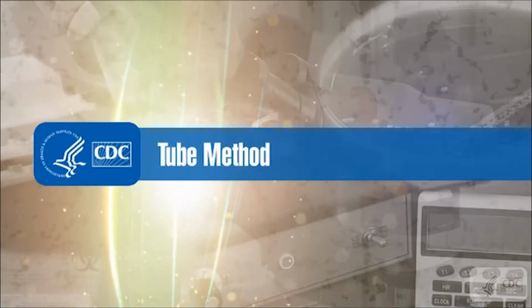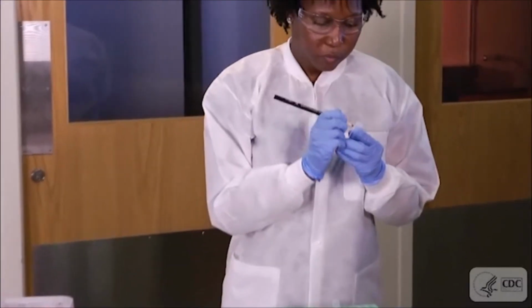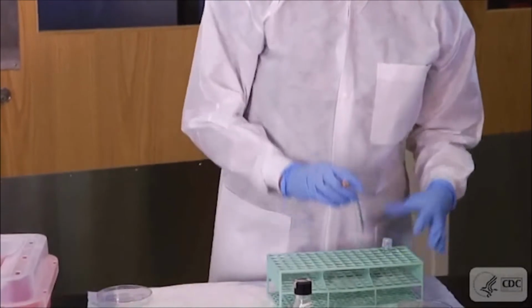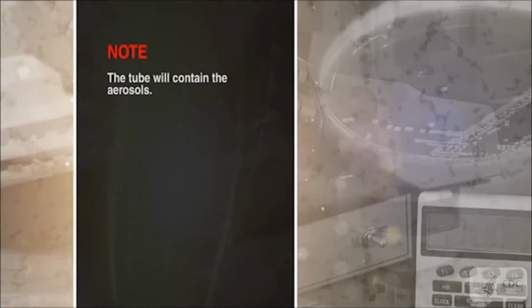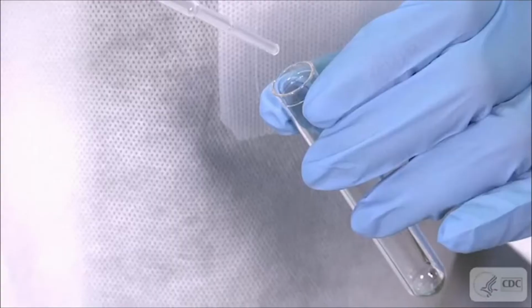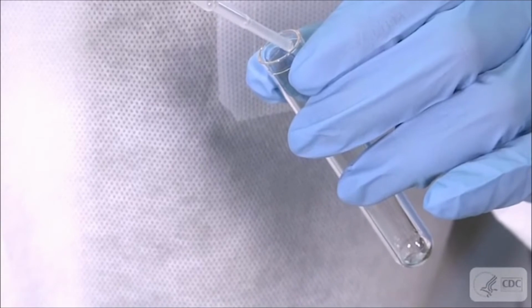To perform the tube method, first label the two 12 by 75 mm test tubes with positive and negative and place them in a test tube tray. The tube will contain the aerosols. Then add 4 to 5 drops of hydrogen peroxide solution to each of the 12 by 75 mm test tubes.